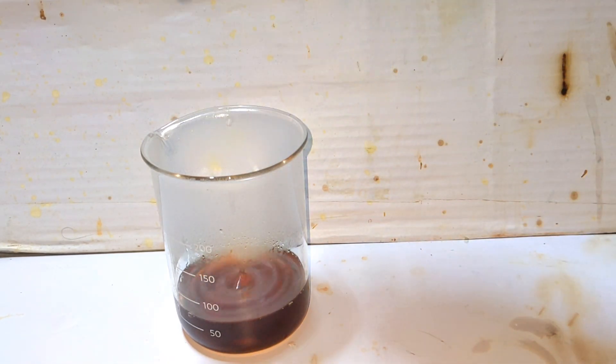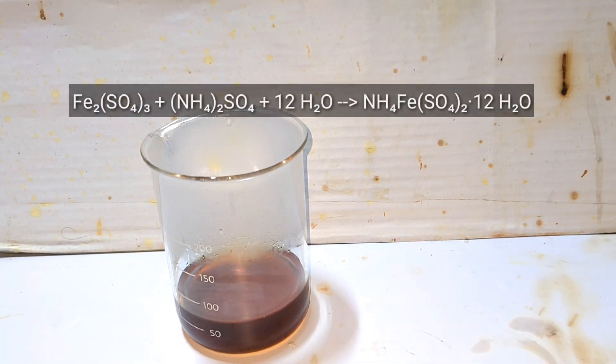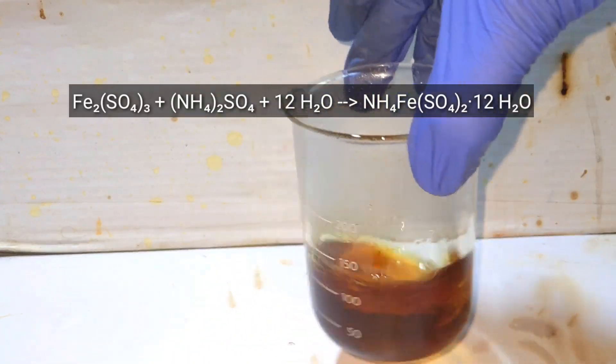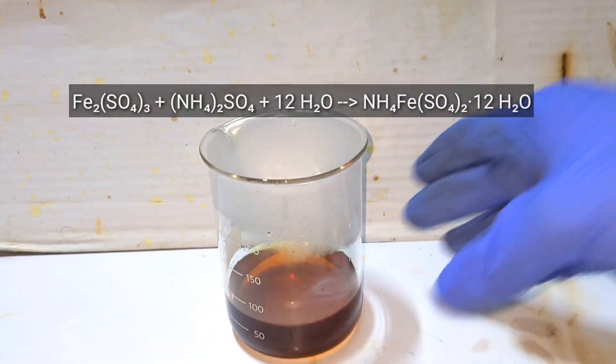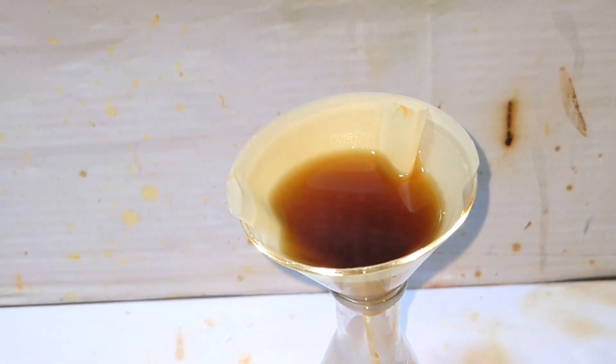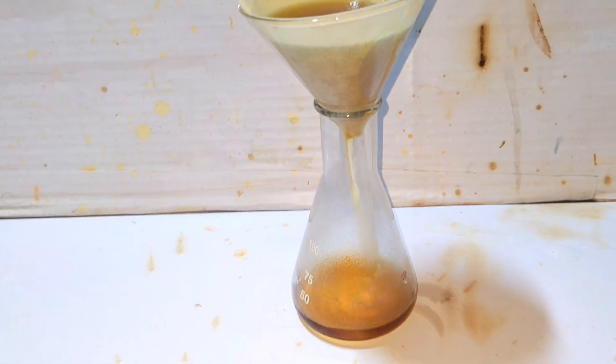This results in the formation of the complex ammonium iron(III) sulfate. This is the balanced chemical equation for the reaction. Now we quickly filter the solution to remove any impurities present.